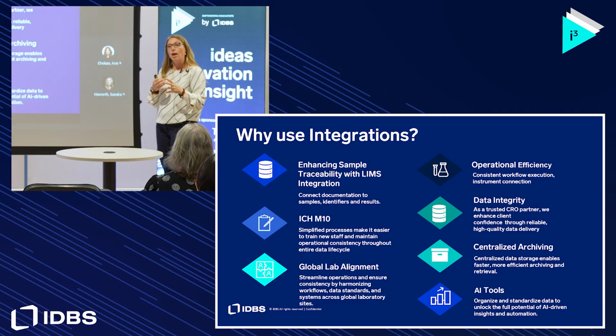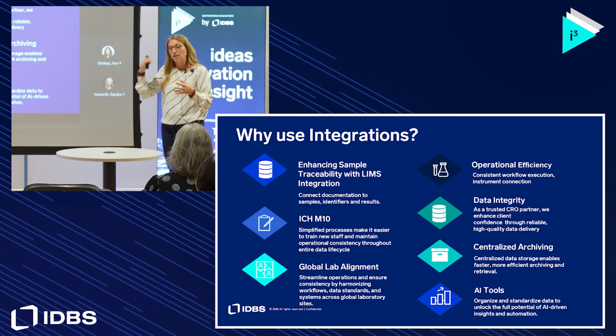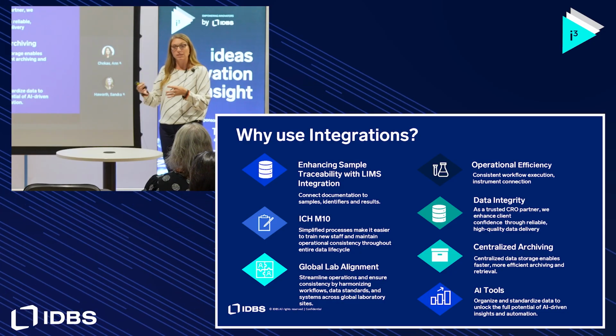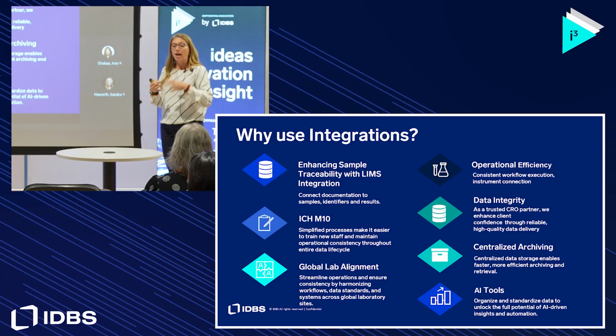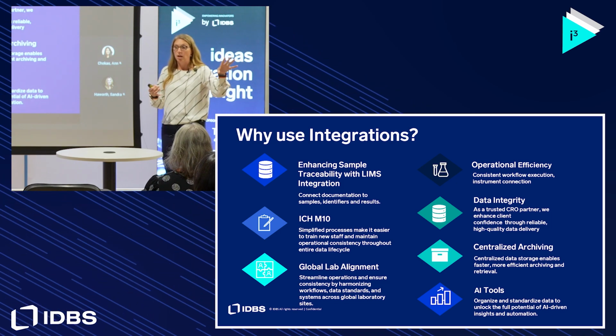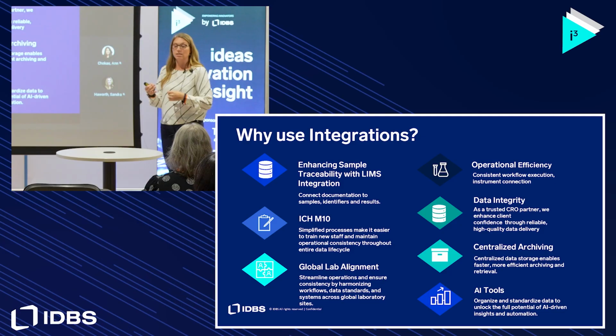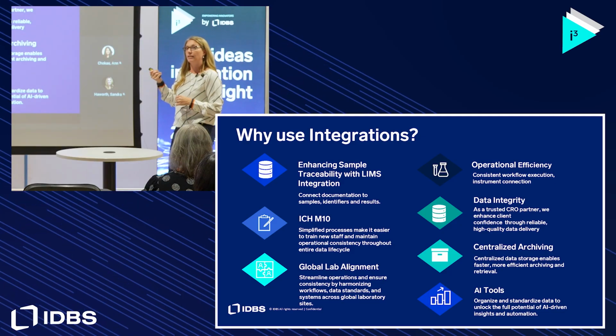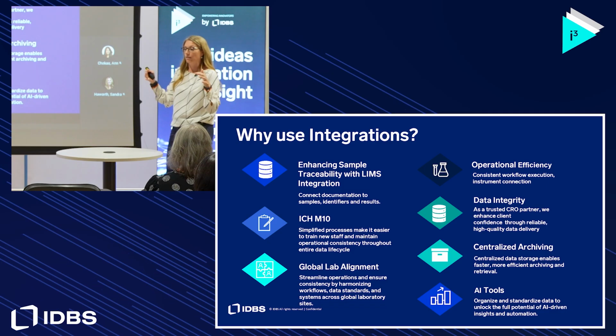And so now we're able to essentially document the whole accessioning process in ELN, and document discrepancies that are found in real time, all just because we connected to Watson. They don't have to open Watson to do this process. It's the simple data link, which I will get into, but it really helps connect the data from Watson and ELN.